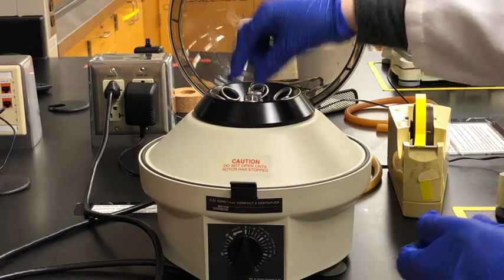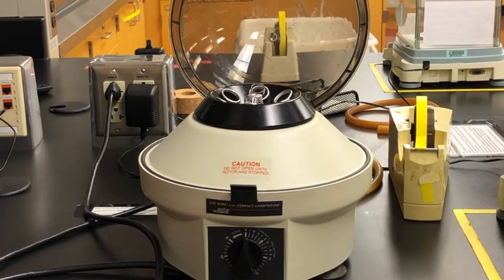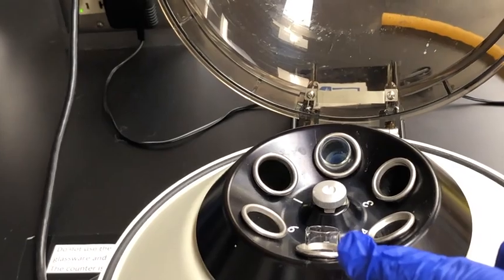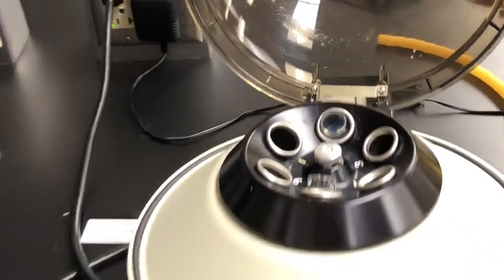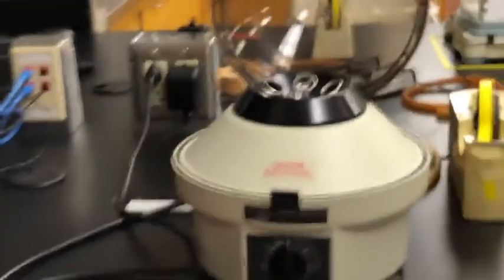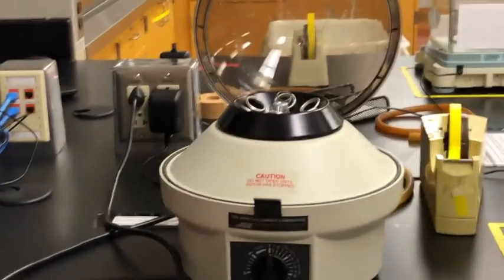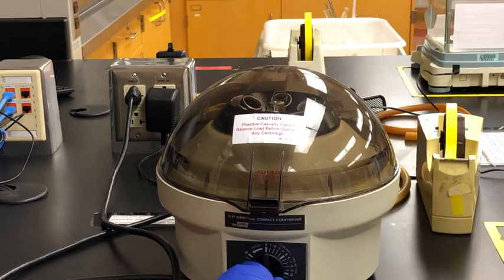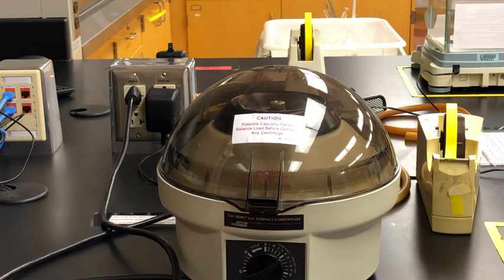These are special test tubes specifically made for the centrifuge. Our sample is across from our centrifuge tube filled with water. We're going to close the lid and set the timer for about five minutes, though this only really needs to run for about one minute. Once we turn it on it's going to spin at a really fast rate, pushing our solid to the bottom of the centrifuge tube and leaving the liquid on top, so it will be easier to separate the two.